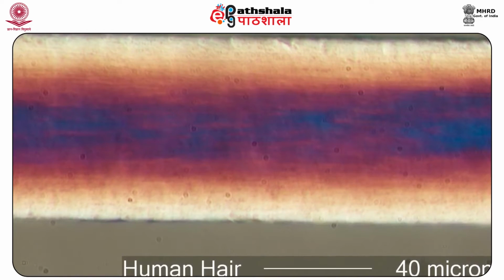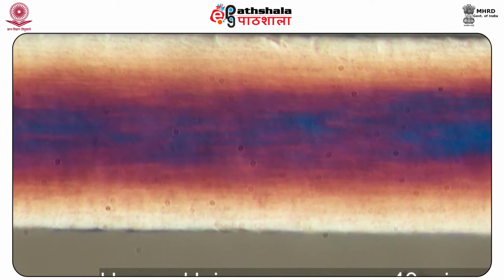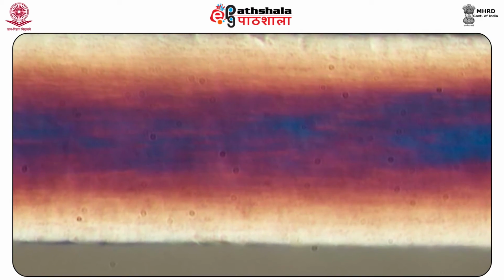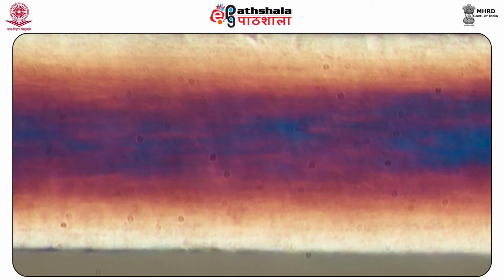The microscopic examination is conducted so as to analyze whether two or more individuals came in contact, or a person came in contact with an object. The value of hair evidence is related to the variability of the hair characteristics between individuals and populations, which can be visualized through the use of the comparison microscope.